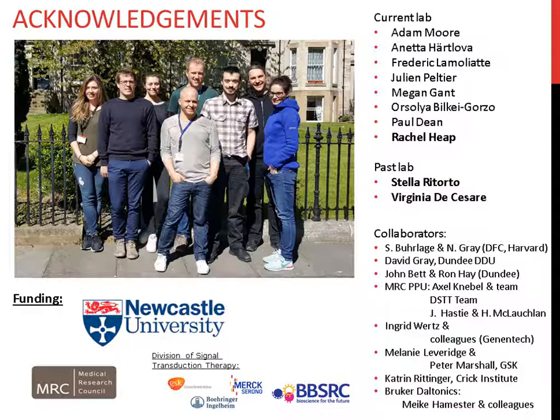Thank you very much. The next question is, what are challenges you face in selecting a matrix for different moieties from small molecule to larger peptides to ubiquitin?